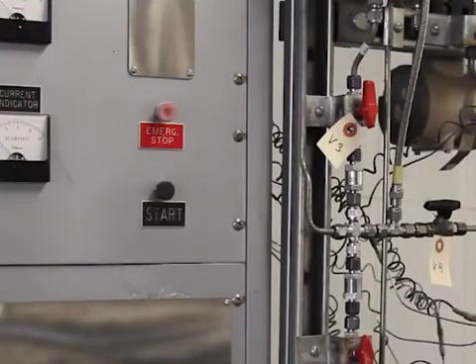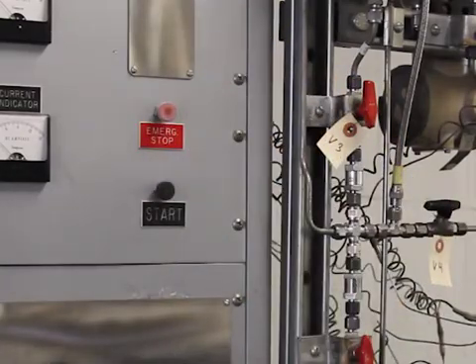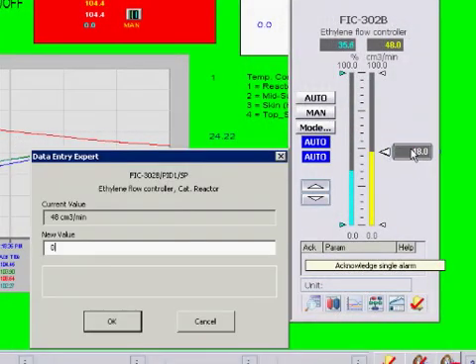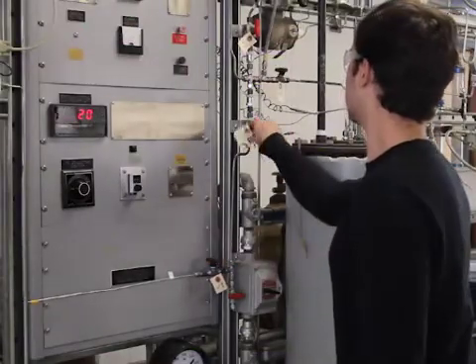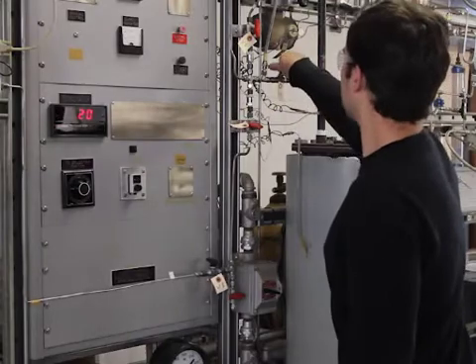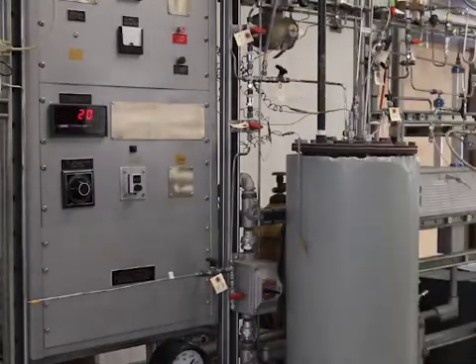Shut down the reactor by pressing the emergency stop button on the sand bath temperature controller. Set the ethylene flow controller to zero percent and close all valves. Wait two minutes before doing the same for the hydrogen. Maintain air flow to the sand bath until it reaches room temperature.